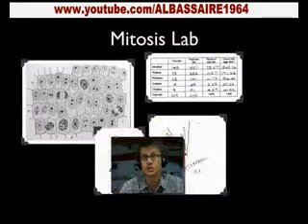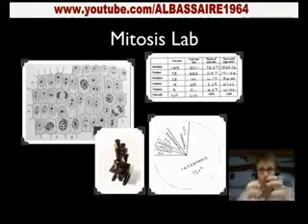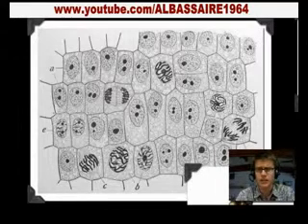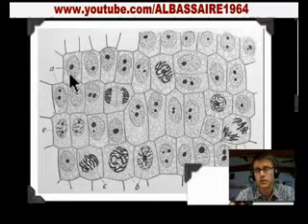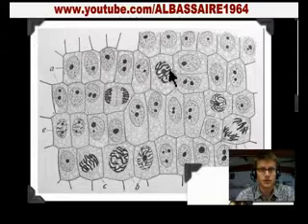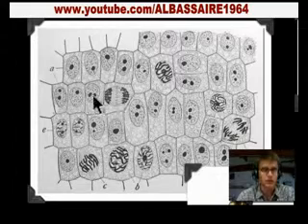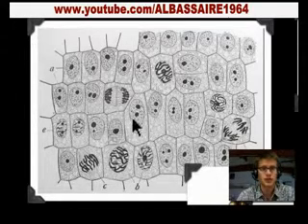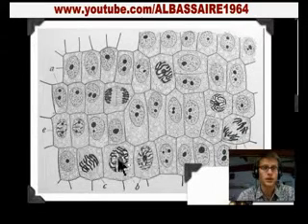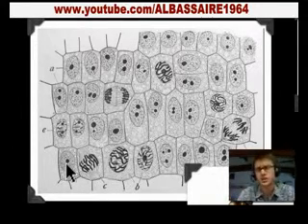Okay, so we can look at either place, but essentially when we look at either place, we're just going to have one person checking boxes and the other person looking underneath cells at the microscope. And so one person will be filling in a data chart like this, and the other one is simply going to be looking underneath the microscope at all these different cells and counting it out like this. Interphase, interphase, interphase, prophase, interphase, interphase, anaphase, interphase, prophase, prophase, metaphase, interphase, and the other person is just feverishly writing those down, checking boxes as quickly as they can.